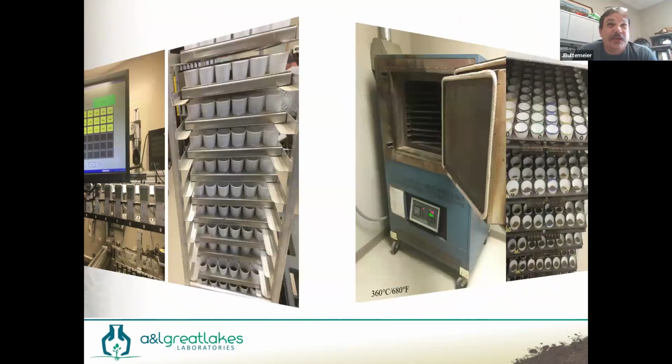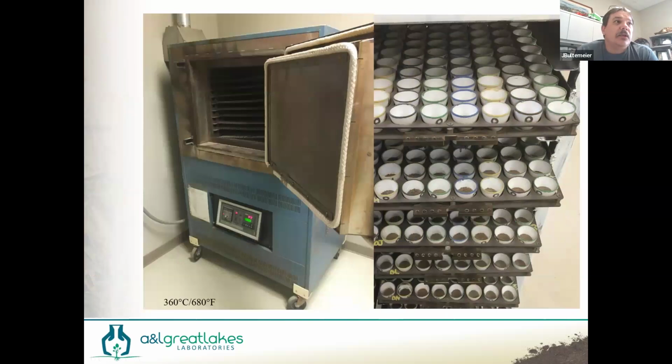So again, soil pH is fairly consistent. Organic matter is probably the most simplistic thing we do. And again, very similar across a lot of the materials. We will take a known volume or scoop of material, and you'll see on the right side here, these crucibles. You'll put that known amount of soil, a weighed or measured amount of soil, into that crucible.